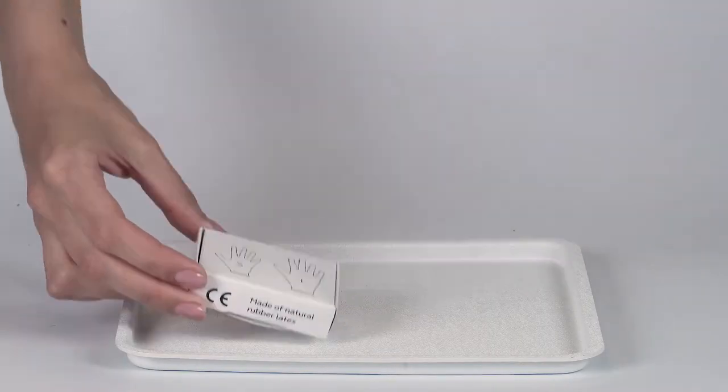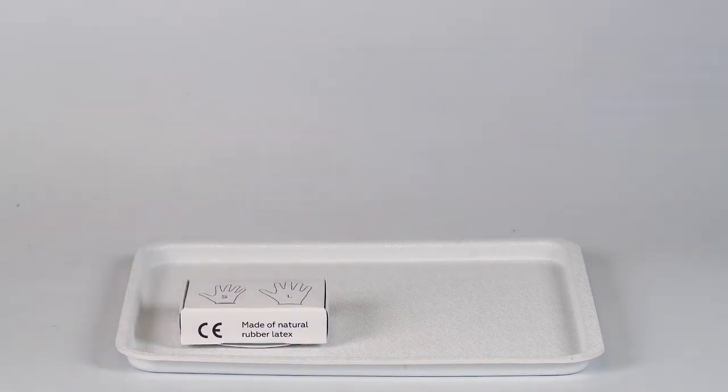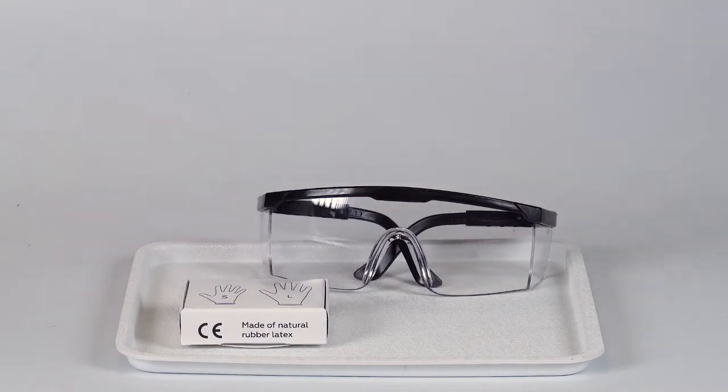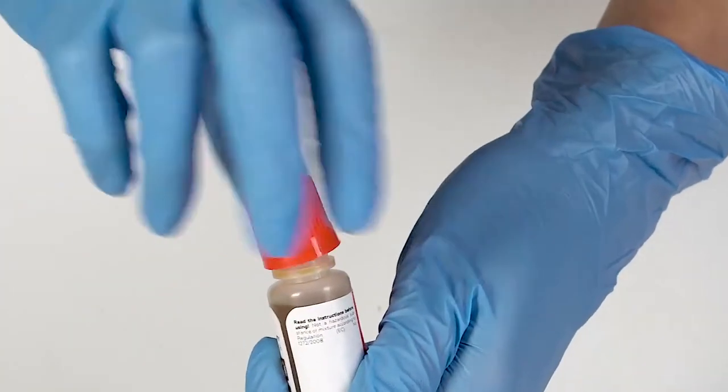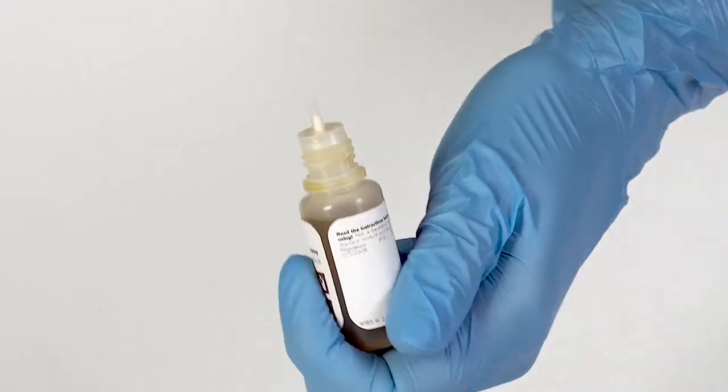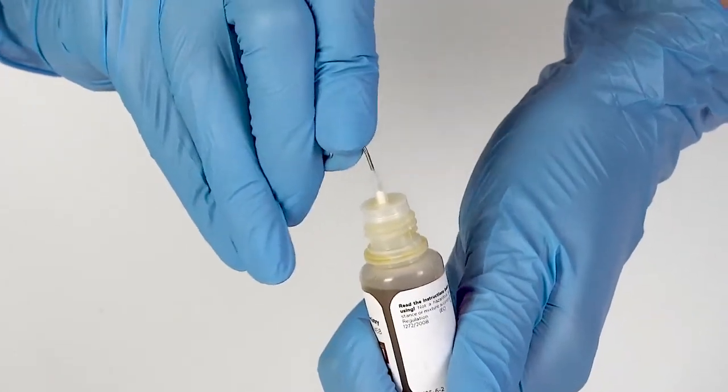Perform this experiment on a plastic tray to contain any possible spills. Don't forget to put on protective gloves and goggles before doing the experiment. To open a bottle containing a reagent, push down the cap and turn it. Pierce the bottle nozzle with an unbent paper clip.